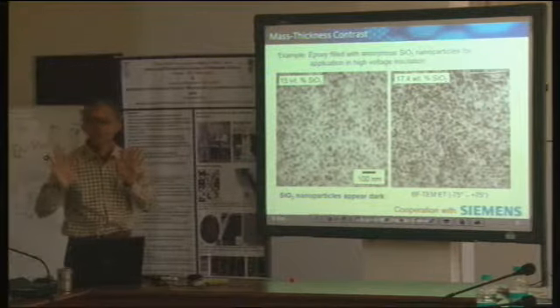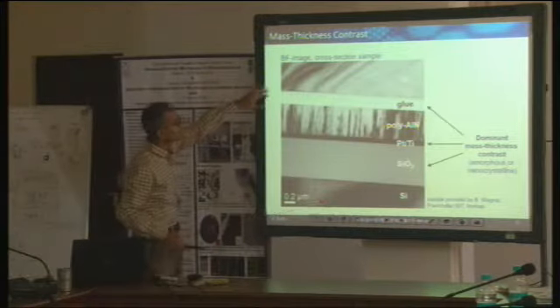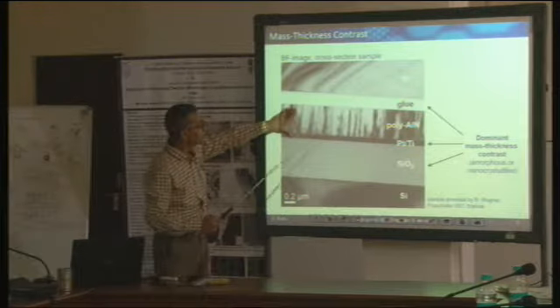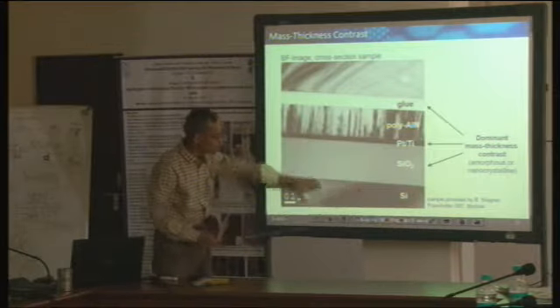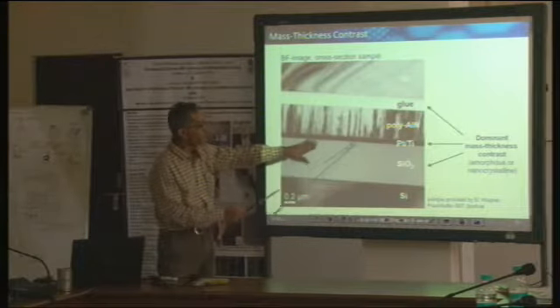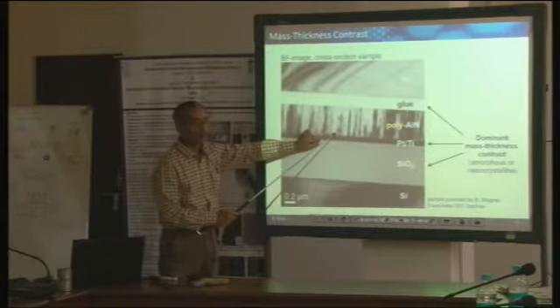Yeah. Okay, good. So then we see one more example. This is a TEM sample wherein we have the polycrystalline aluminum nitride film grown on SiO2, grown on a silicon substrate, but this silicon substrate has the amorphous SiO2 layer and a platinum titanium layer also here.